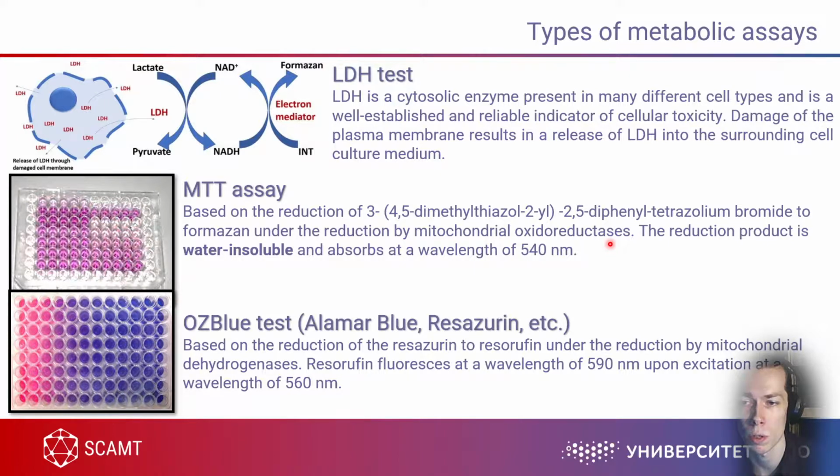It can be because of disruption of the mitochondrial potential. It can be some enzyme activity of your nanoparticles. Your nanoparticles, for example, can cut these oxidoreductase enzymes by themselves. So there are a lot of ways to reduce mitochondrial activity. Because of this, the MTT assay is not a very good choice if you want answers.